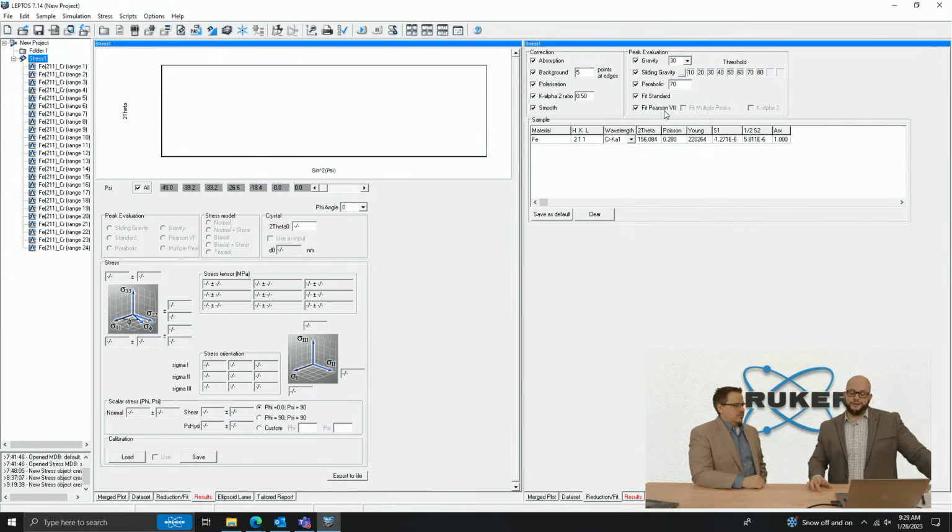But the rule of thumb is, if you have good data, it doesn't matter what you use. You should get a consistent result. A lot of the origin of this goes back to computers not being super fast, and the gravity type method is much faster to calculate.